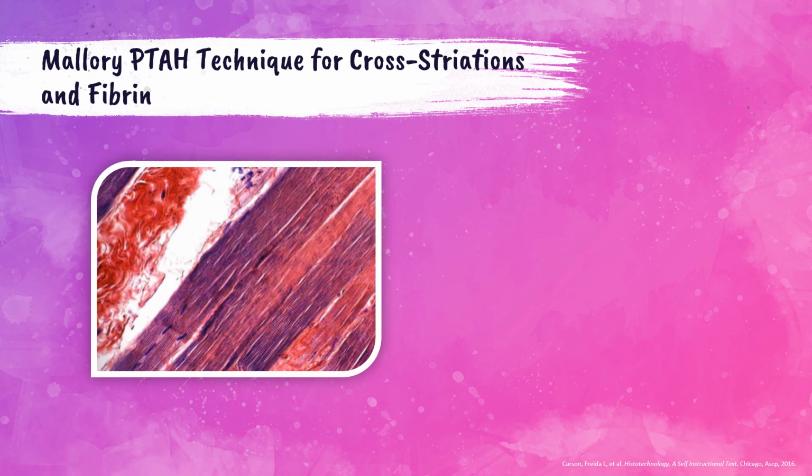So this photo shows a formalin-fixed skeletal muscle that is stained with the Mallory PTAH technique. The uneven staining here is visible, and this is common with formalin-fixed tissue for this technique. So this is why the Zenker solution is preferred for this stain type.